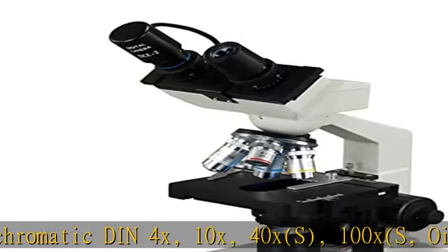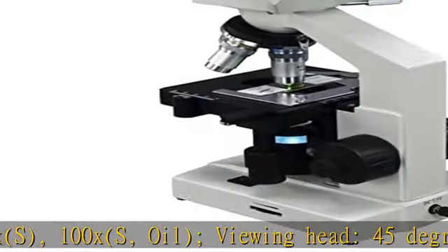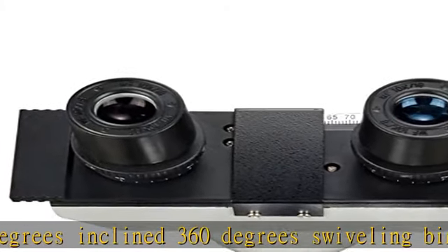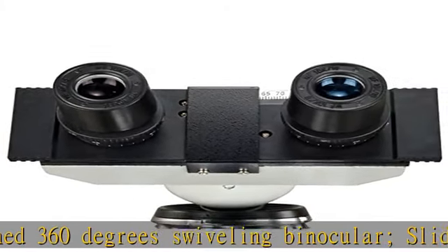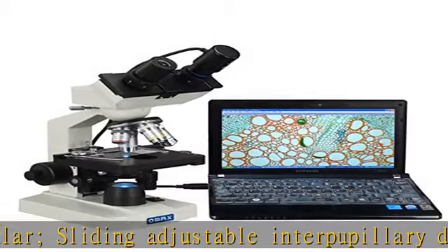Viewing head: 45 degrees inclined, 360 degrees swiveling binocular. Sliding adjustable interpupillary distance 55-75mm. Ocular diopter adjustable on both eye tubes.